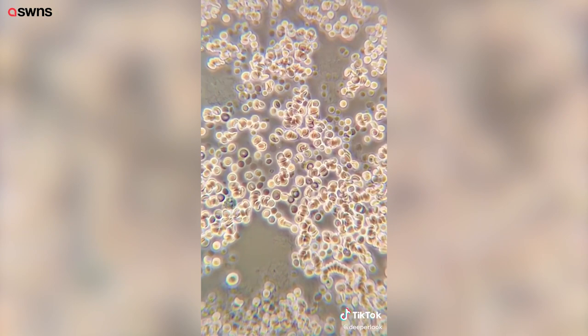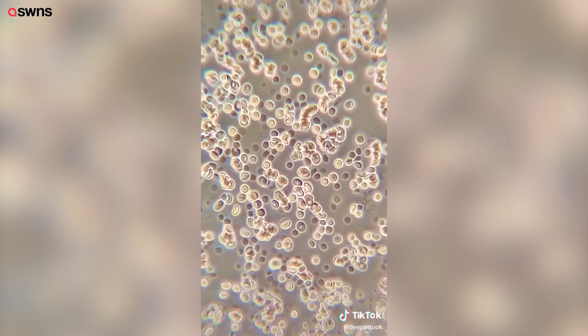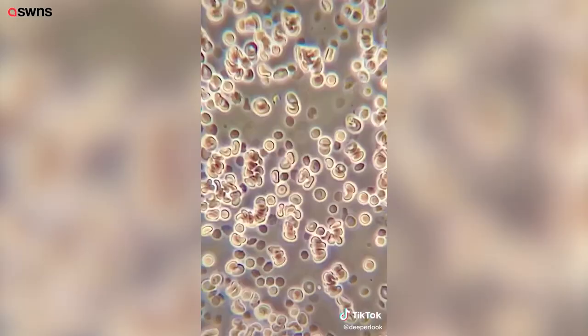I added some saline solution to get a good look at individual red blood cells. Under phase contrast microscopy, you can really see their textbook jelly donut shape. Zoomed in a little more, you can see them stacking together. Bonus points if you can find a white blood cell.